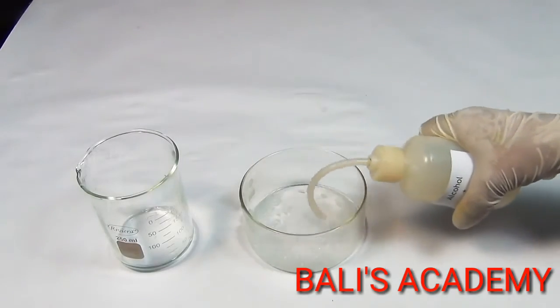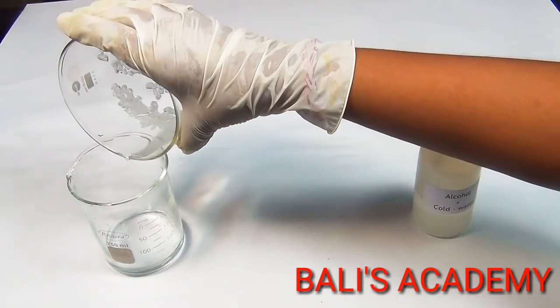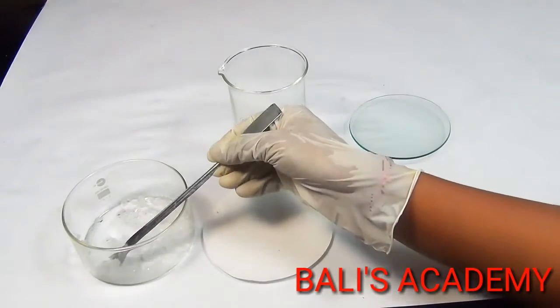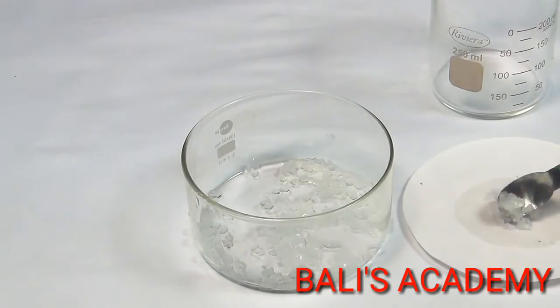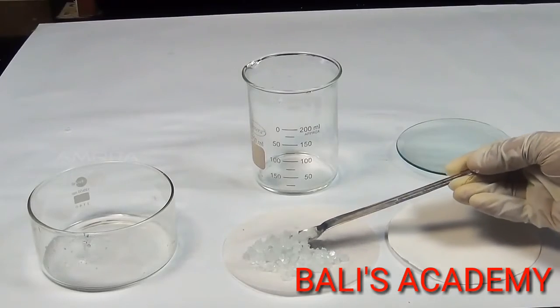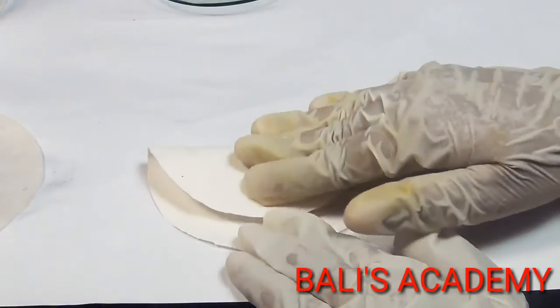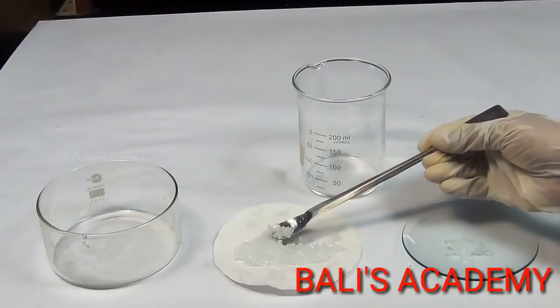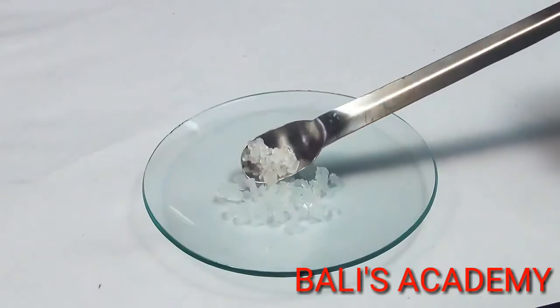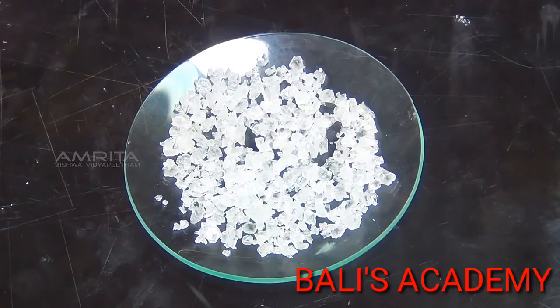Wash the crystals two or three times with a little alcohol containing a small amount of cold water. Using the spatula, remove the crystals to a filter paper which soaks up the solution. Transfer the crystals to another filter paper and dry by pressing them gently between the folds of the filter paper. Then transfer the crystals into a watch glass. The crystals of pure potash alum are colourless and octahedral in shape.